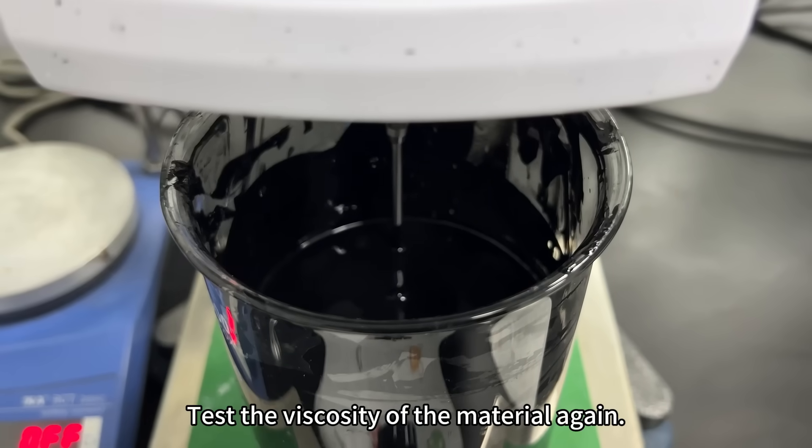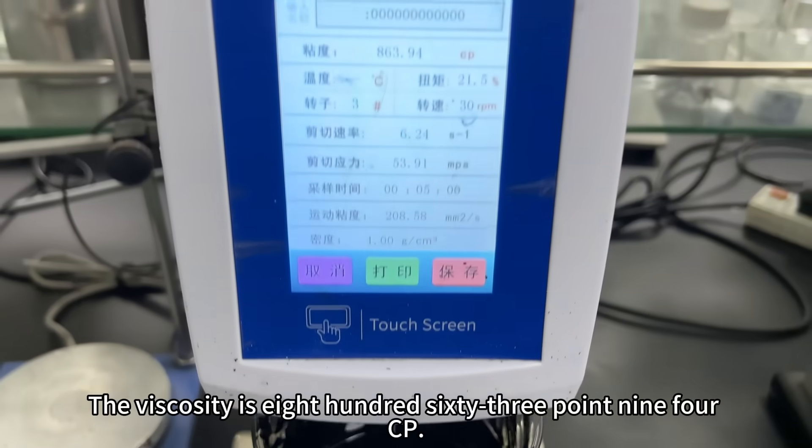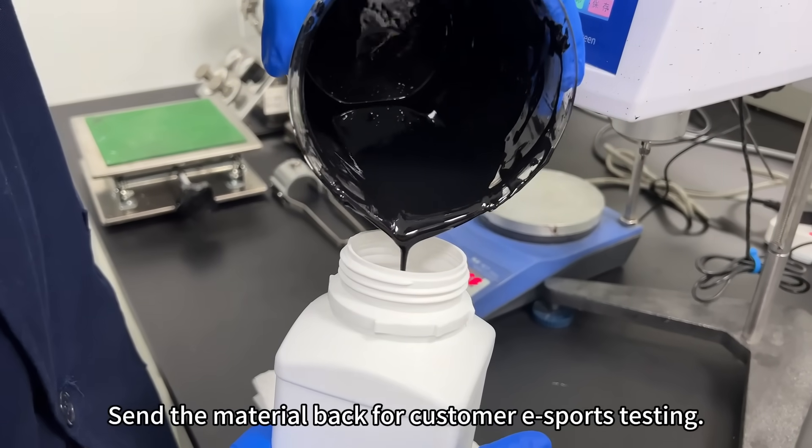After treatment, we tested the viscosity of the material again. The viscosity is 863.94 cp, which meets the customer's requirements. The material was sent back for customer evaluation testing.